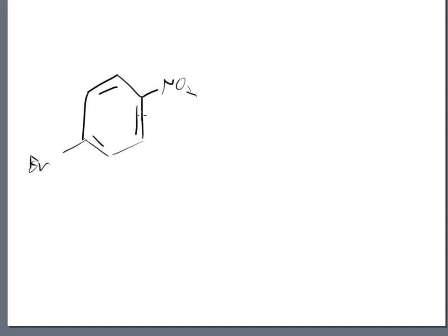So I think that you can do this. I hope after all of these example problems that we did, I'm going to ding dong that one, and that is the ortho position. But look at this. If I go up to that one, that is also the ortho position. So I cannot ding dong that one, right? These two are exactly the same. And the reason is because both of these are next door to an NO2 group, and then they are 2 carbons away from that bromine group.